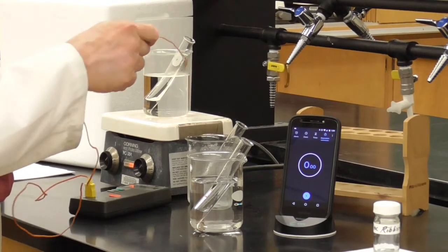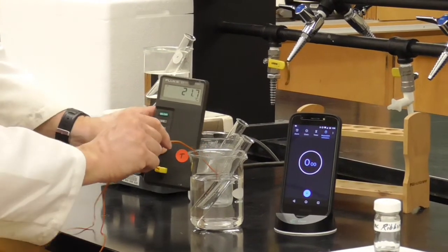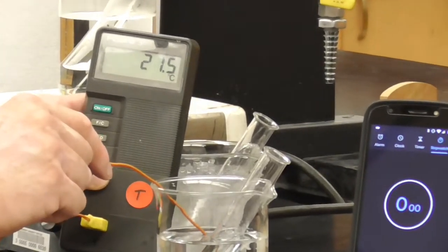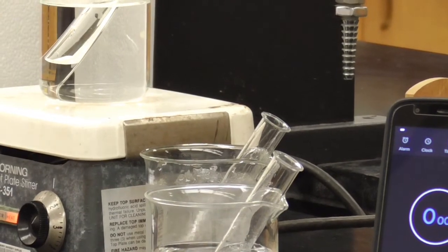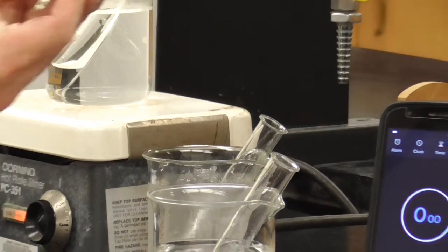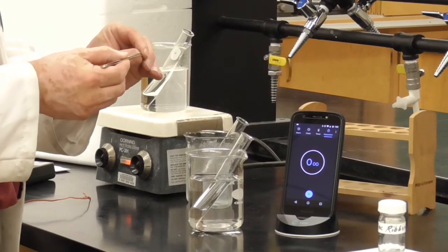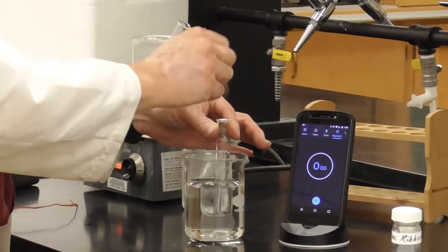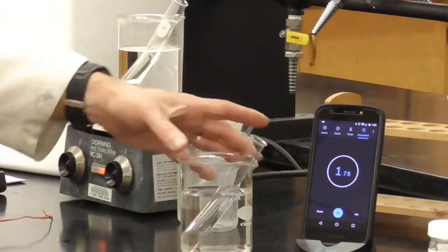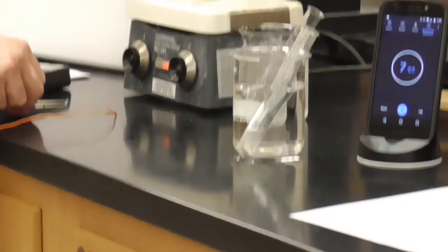All right, so let's look at what is the temperature of the one at room temperature. There you go, you can see it. Yes, all right. So there's our temperature. We'll take our zinc strip, we'll drop it in that test tube and start the timer. And you want to see how long the reaction takes. So when it stops bubbling, that's when we'll call it. So I'll drop it in now, start the reaction. And hopefully, can you see that okay? Mm-hmm. All right, good. So we'll watch that reaction until it stops.